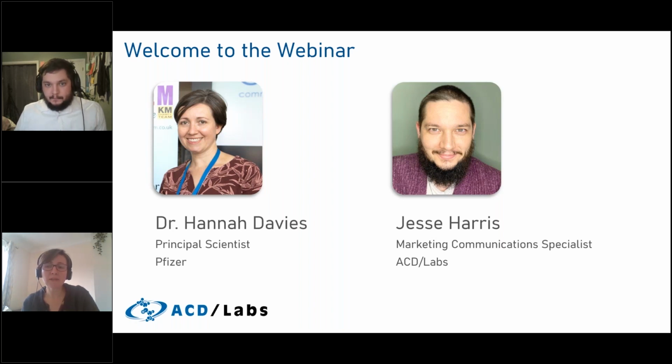I don't have direct experience of some of the earlier software that were listed. I'm just aware that through Pfizer's journey with databasing, that's the software that was used historically and so on. But for me, the power and the beauty of Luminata, as I spoke to in the presentation, is just having everything in one place.